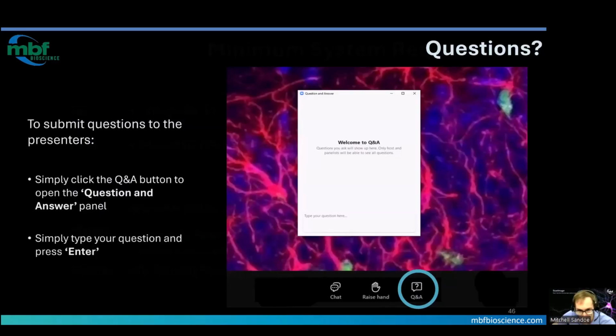And now I'd like to open the floor to any questions that we have. I see some questions about this 0MQ implementation. We have a specific question about whether it supports zero copy sharing via the Windows API. I can answer that.